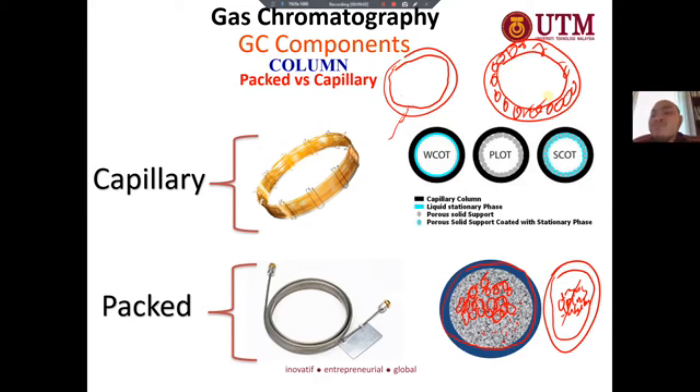But nowadays they have the technologies where they can increase the thickness of the coating without the addition of what we call solid support. Like here, without the addition of the solid support, they can already increase the thickness of the wall coated.